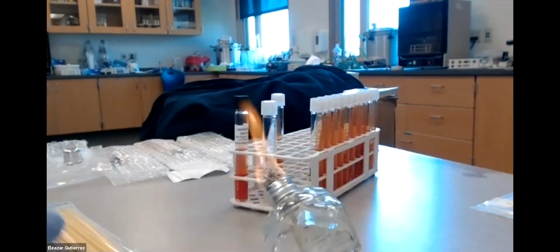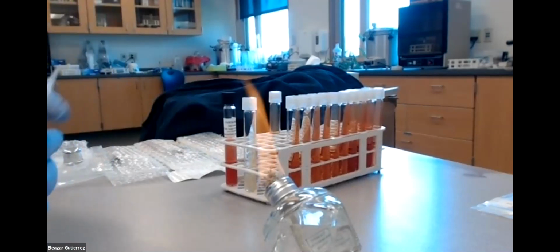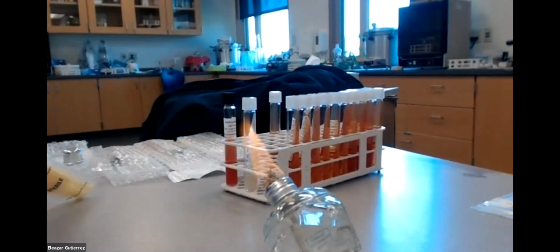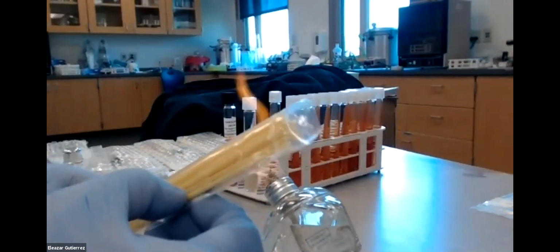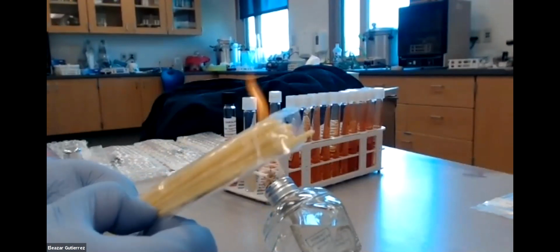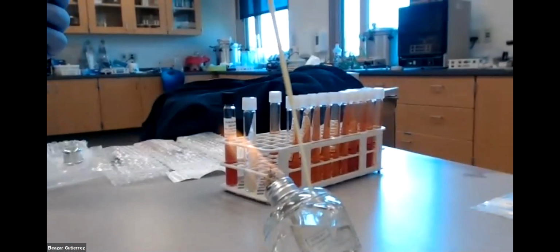And that's because everything that we do here has to be done aseptically. Okay. So what are we going to do? We're going to take out 1 loop from here. We're going to do it aseptically. That means that we're going to push it up individually outside of the package, like so. Okay. Once it's outside, I'm going to grab that loop and pull it out. That leaves everything else nice and clean.